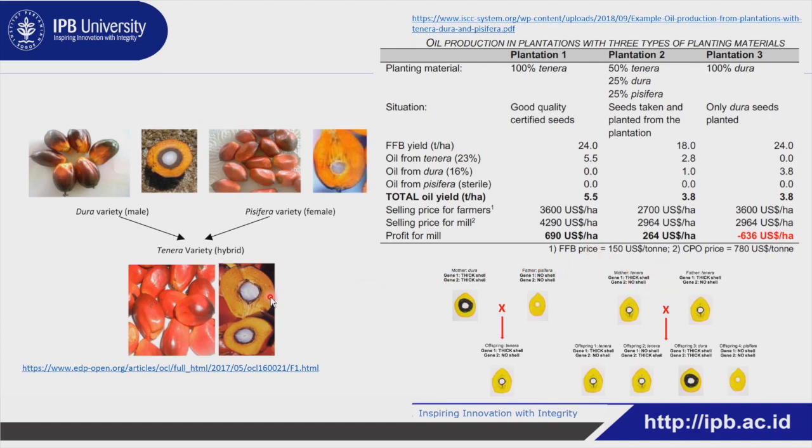And if you compare to, let's say, pepper or tomato, it is very different, because it's not that easy to produce a hybrid seed from the seed of the palm oil. So to solve this problem we use clonal propagation of a really proven Tenera variety.